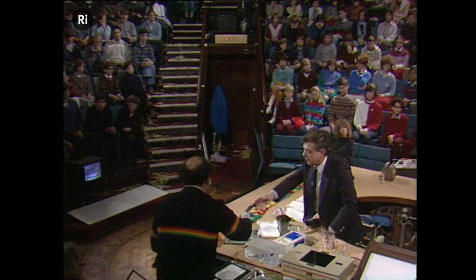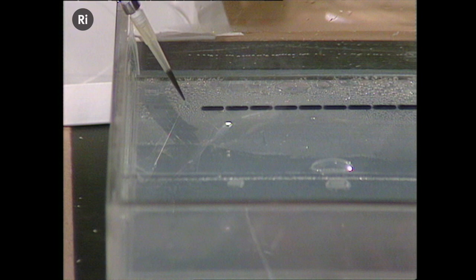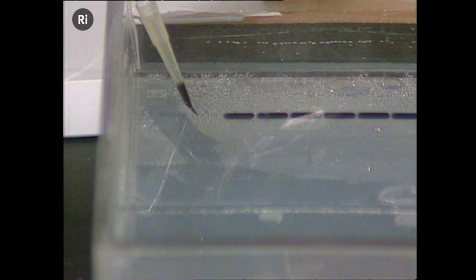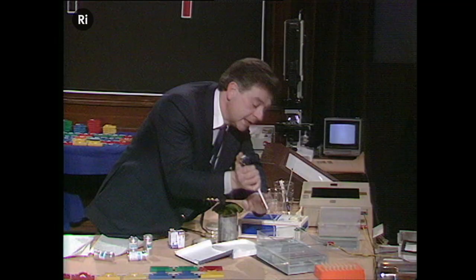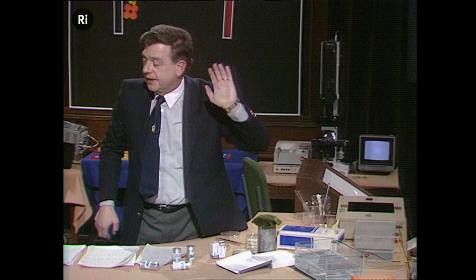So Nigel's going to give me this pipette, and I'm going to put a little bit of the material in, just into these slots here at this end. Just a little bit in there. Now, what's going to happen is the electricity is going to run through that. And while that's happening, let's explain the basis on which that can separate molecules.